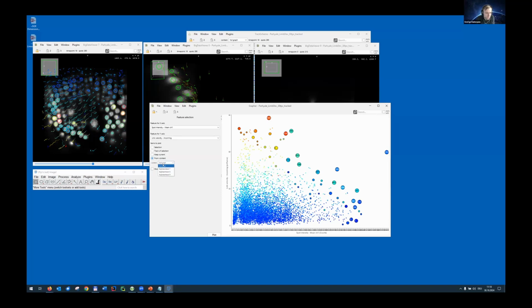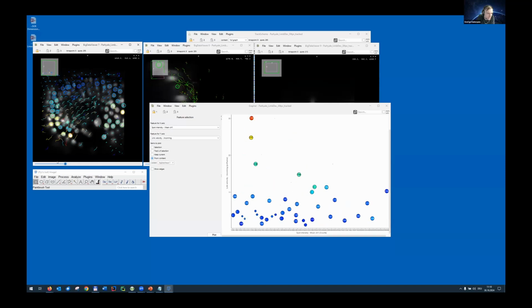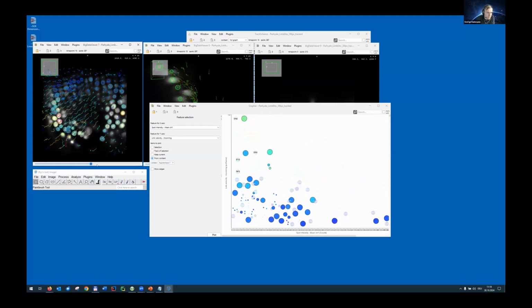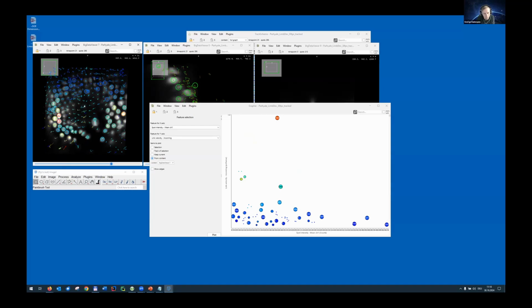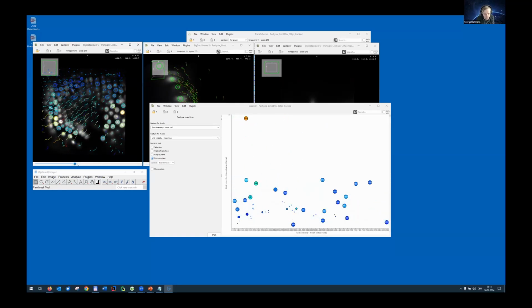There's one more thing that I wanted to show about this, and that's the possibility that you can reduce this window. If you choose the context, you can decide to go for full graph, but you can also choose the content of the big data viewer. That's here the window called Big Data Viewer 7, and you can decide to choose this window. Then you go to plot, and if you slide through time, so that's like the time axis that you can use in the big data view, you see only the points in the grapher that are actually shown in the current big data viewer settings, so to say. And since this shows all the spots of the current time frame, then you can see these spots in the grapher as well. And that's kind of a possibility to filter all the data.